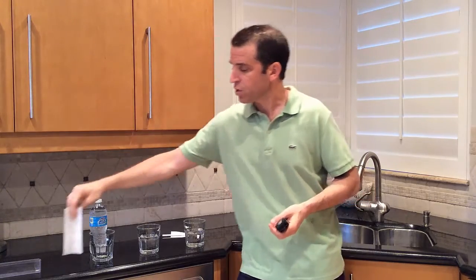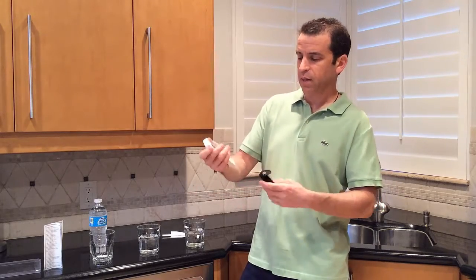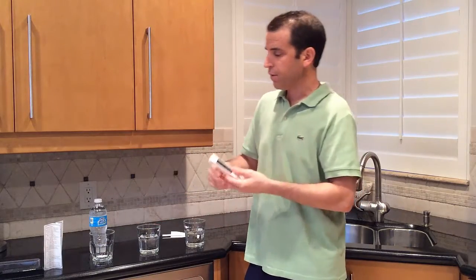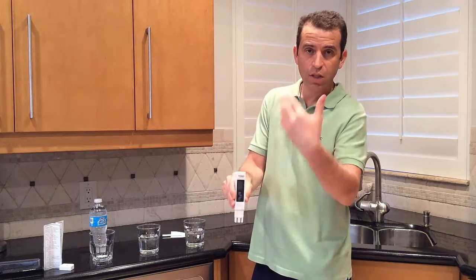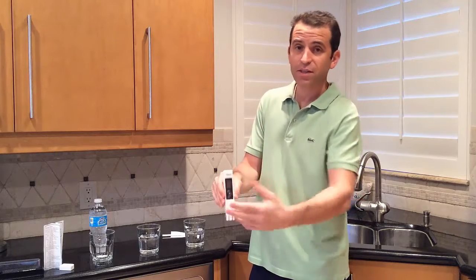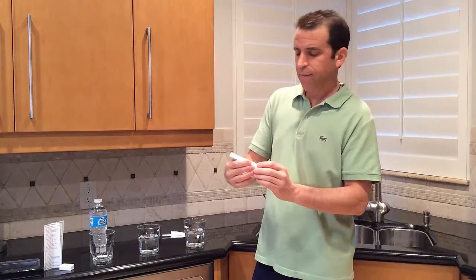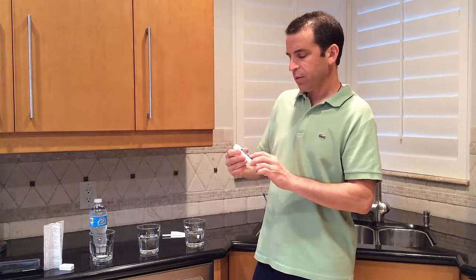For this video we're just going to test the purification three different ways. The product has three buttons: on and off, a shift button which lets you change from Fahrenheit to Celsius, and a hold button — which you'll want to use when you immerse it in the water. I'll press hold and then show you the reading, and I'll write down the number.